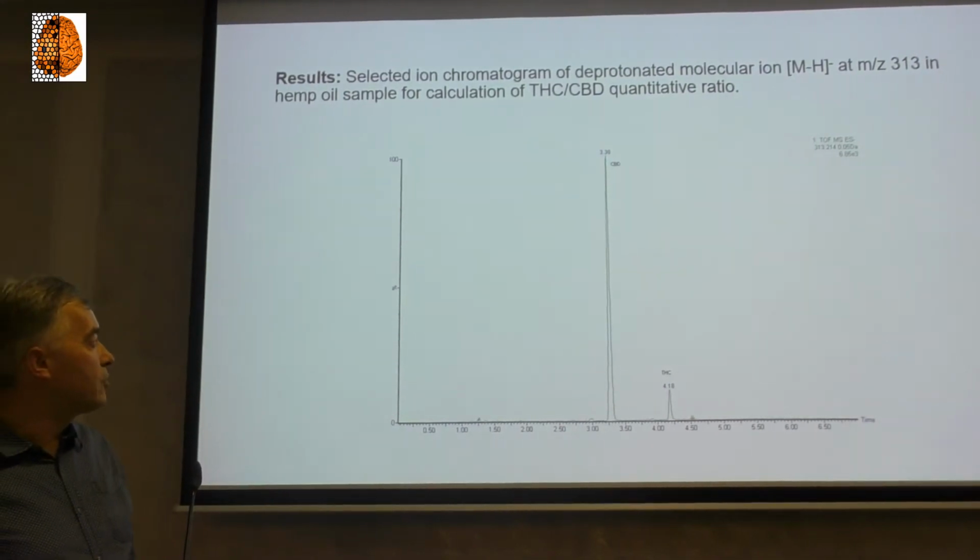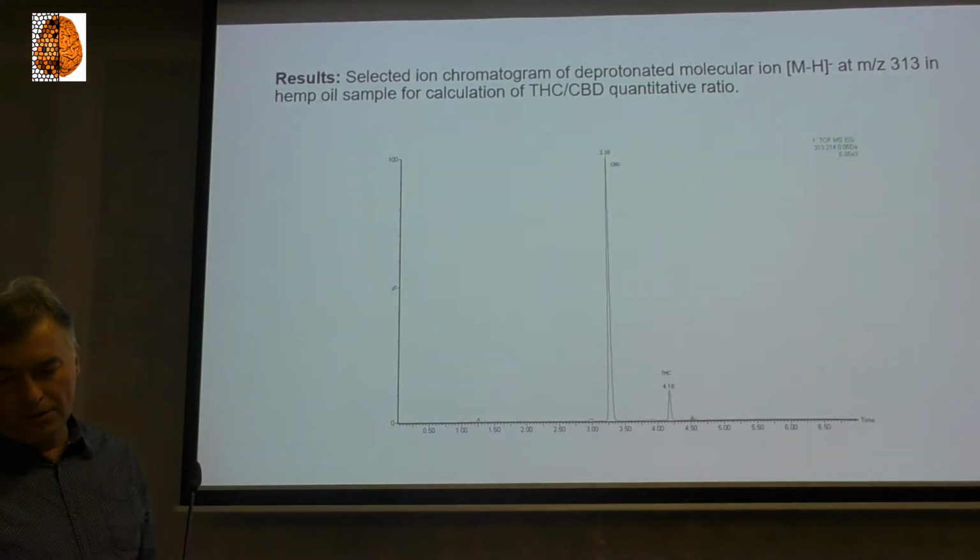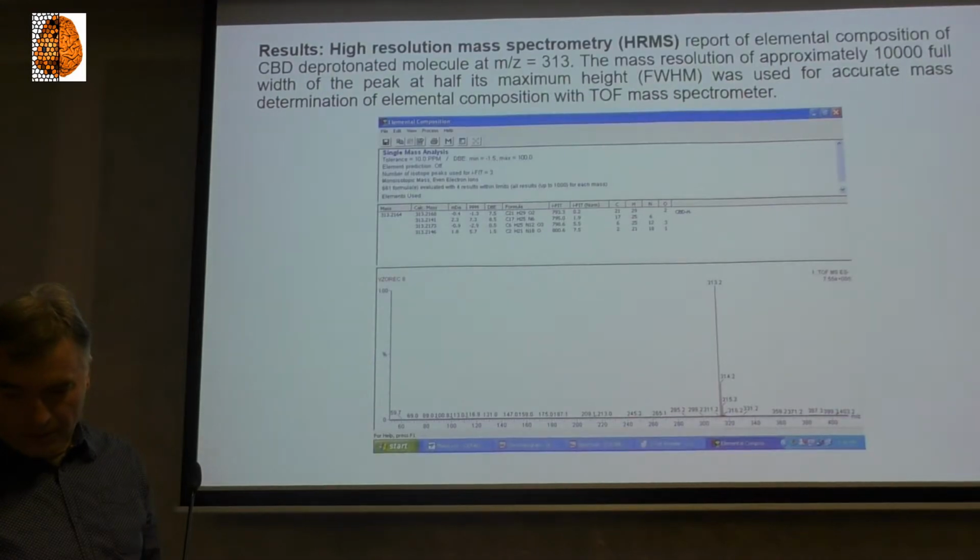which is our first goal in these measurements: to measure the THC CBD ratio. In this case, it is about 1 to 11, and in some cases, our results are completely different, depending on what kind of sample we have in a chemical procedure.